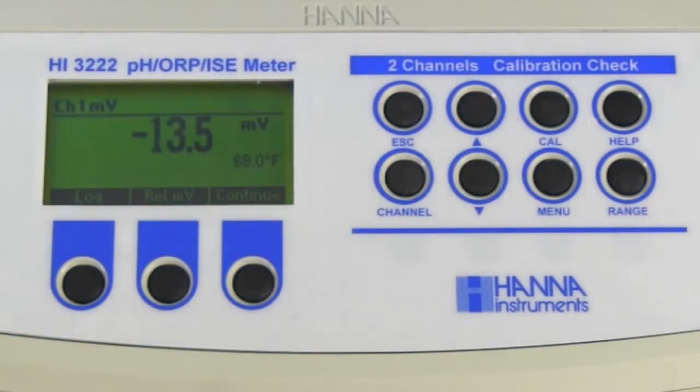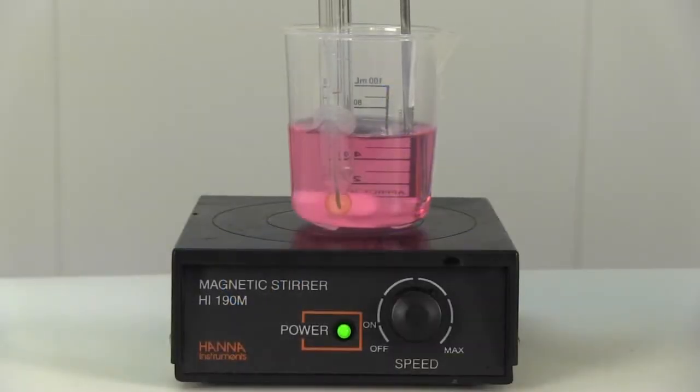We see that our HI1131B has an offset of negative 13.5 millivolt. Next, we need to determine the slope of the pH electrode.